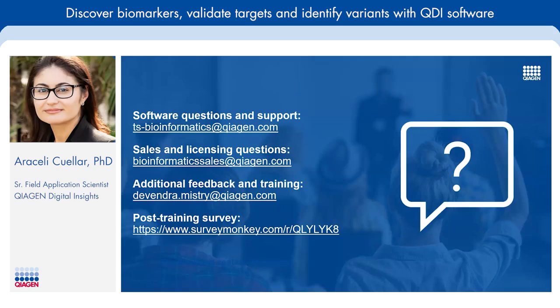How often is IPA updated? IPA is updated on a weekly basis, but it's also updated on a quarterly basis. During our quarterly updates, we get a huge increase of information in terms of public data sets, comparisons, and similar content that's coming from Omicsoft into IPA.